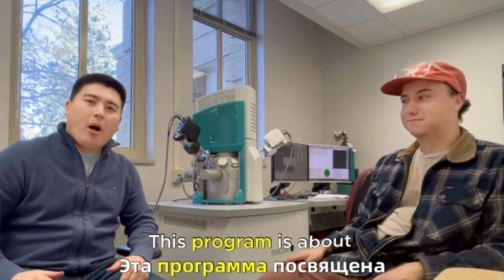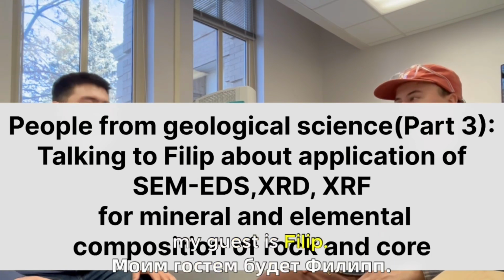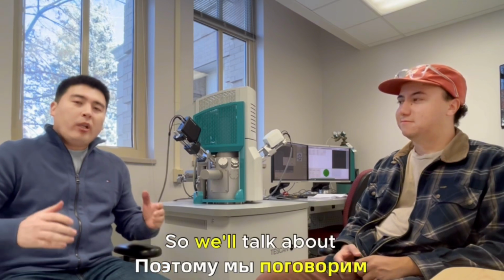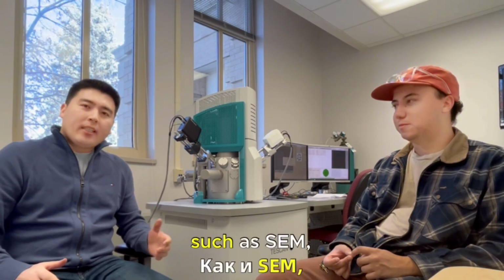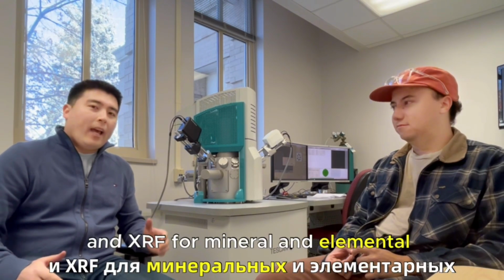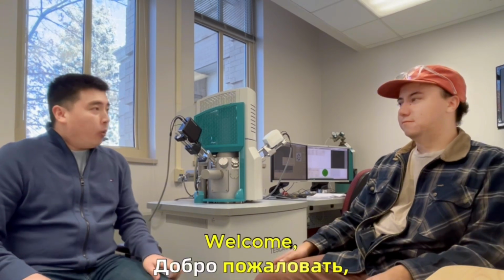This program is about people from geological science. Today my guest is Philip Kasrovich. He's the manager of lab. So we'll talk about application of different techniques such as SEM, XRD, and XRF for mineral and elemental composition of rock and core samples. Welcome, Philip.